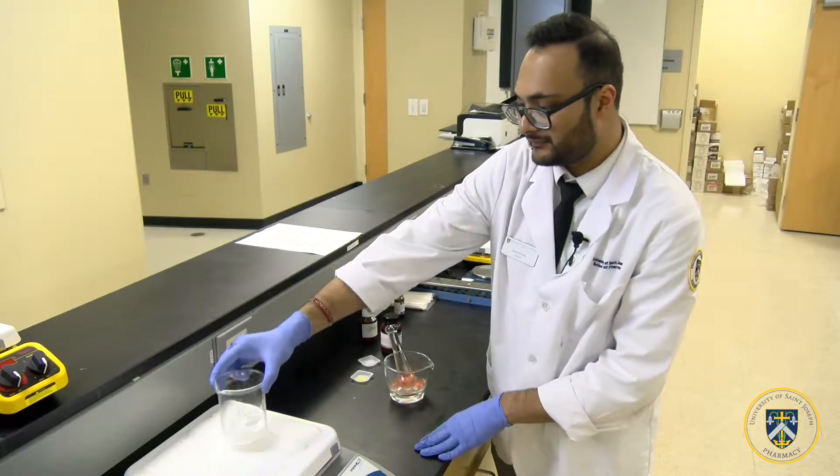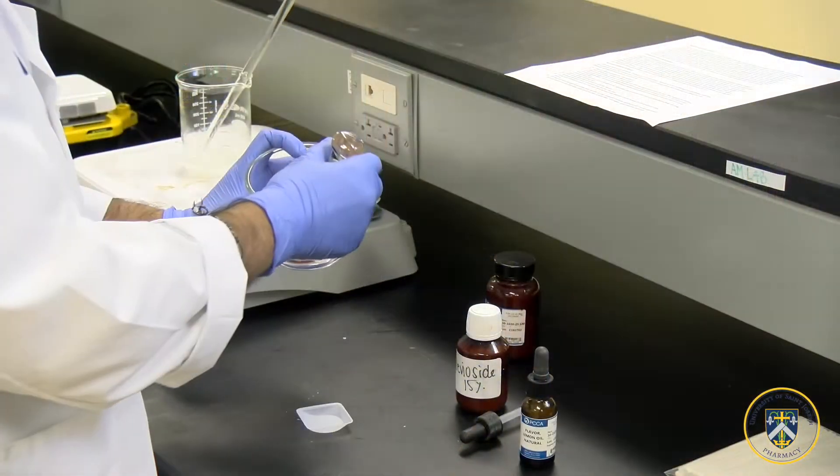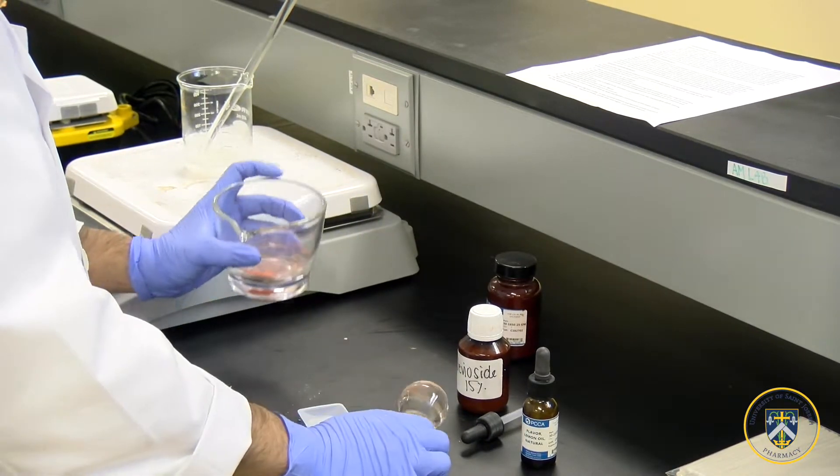Add the sorbitol base in a beaker onto your hot plate to melt it down. After your powder is triturated evenly, add it to a weighing boat.